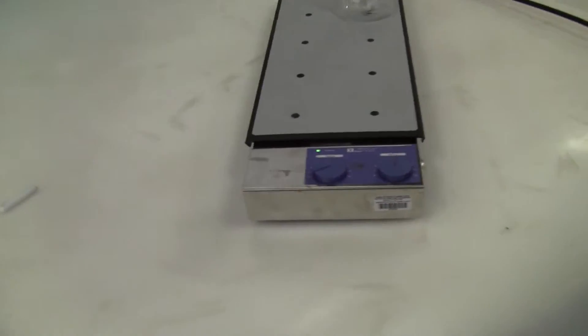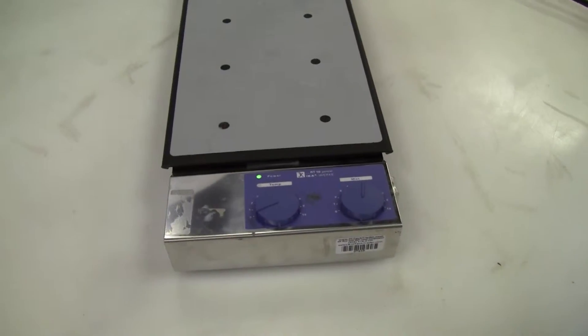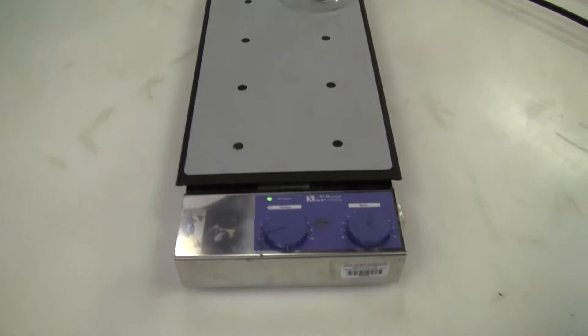Hi, this is Michael Natal from Hitech Trader. Today we're looking at the IKA — it's a hot plate stirrer, it's a multi stir, it's a 10-position stir.